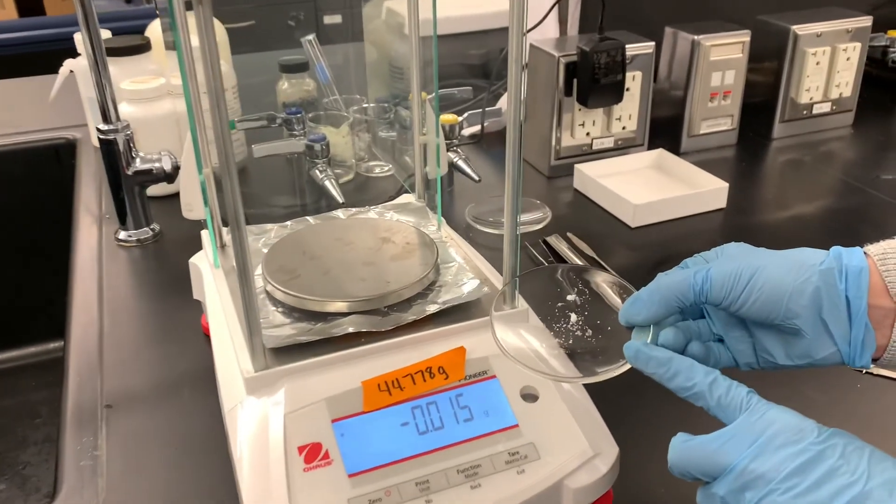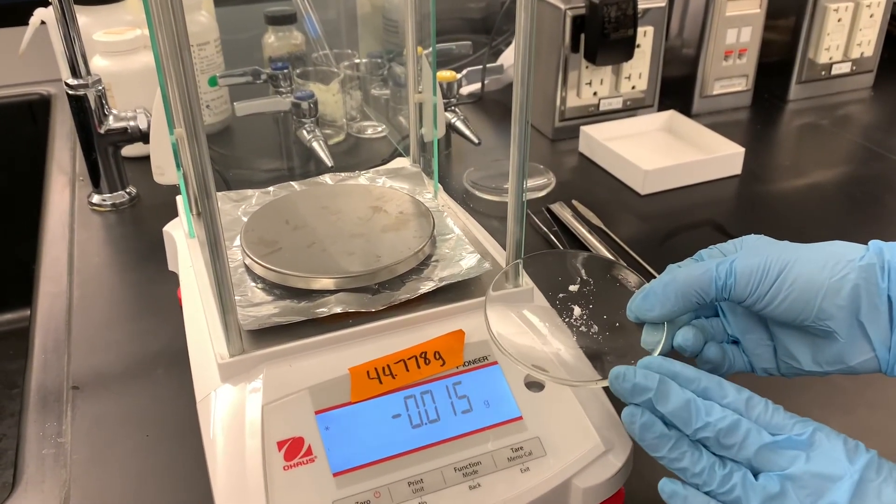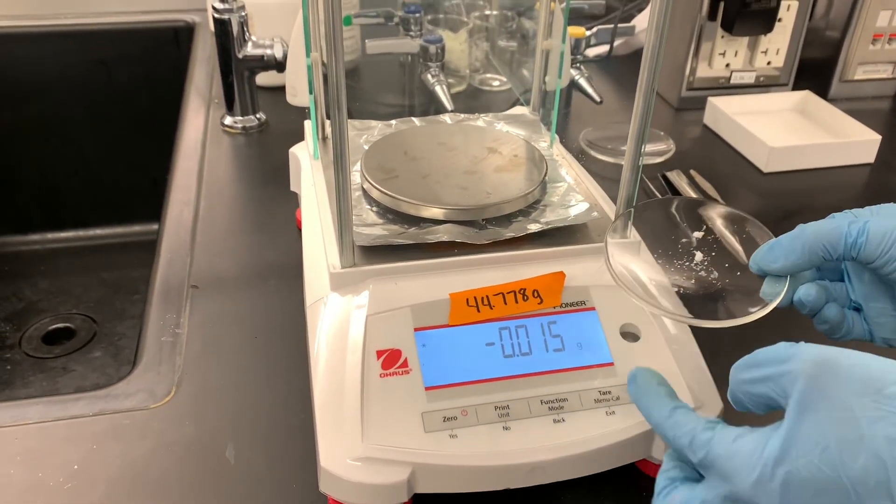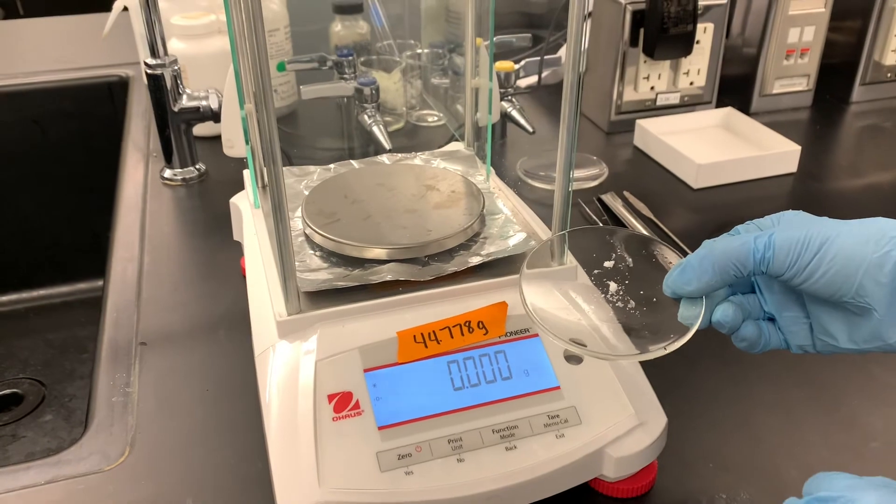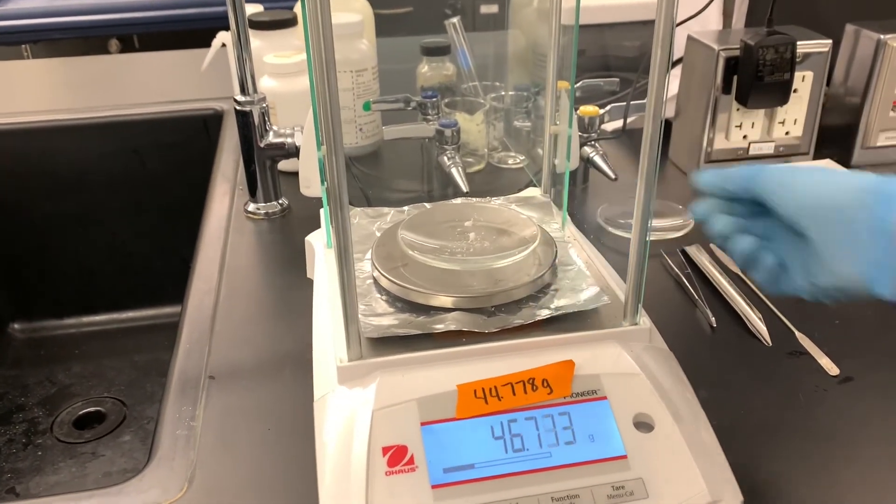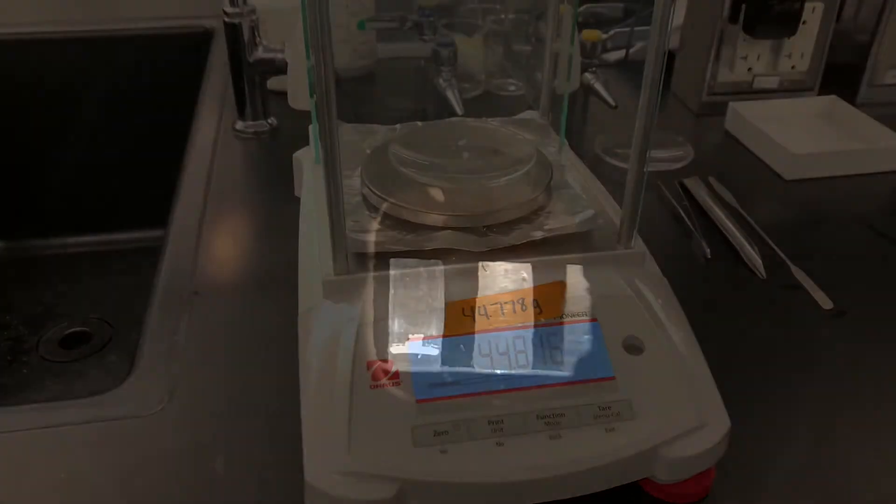This is a watch glass that I pre-weighed before this experiment started, because I know that this experiment does not produce very much product. And this 44.778 grams is the mass of the empty watch glass. I've transferred our small amount of camphor and we're going to get a mass of this watch glass. The difference here is the mass of the product that we've actually synthesized.